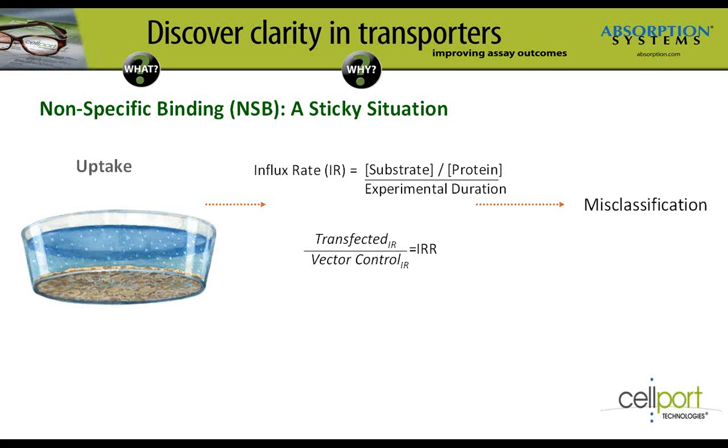ratio. If a compound is lipophilic and adheres to the experimental apparatus, then the influx rate may be underestimated, resulting in lack of discrimination between transfected and non-transfected systems. This also results in a loss of assay sensitivity and potential misclassification. The ramifications of false negatives are profound, including adverse clinical events or compromised efficacy.